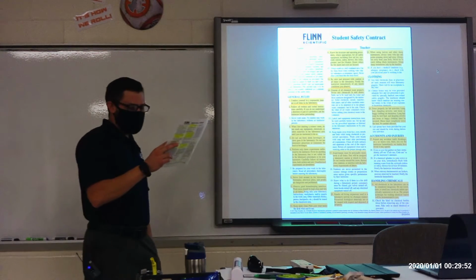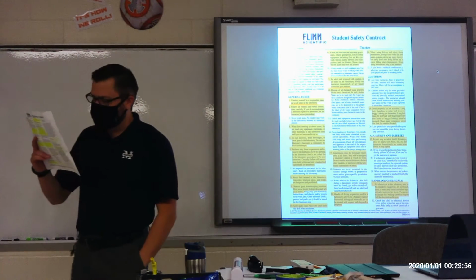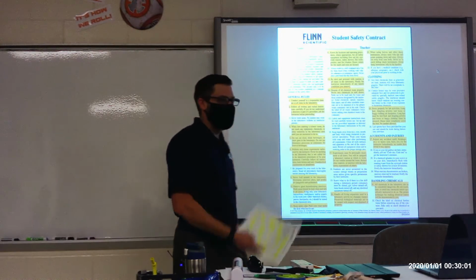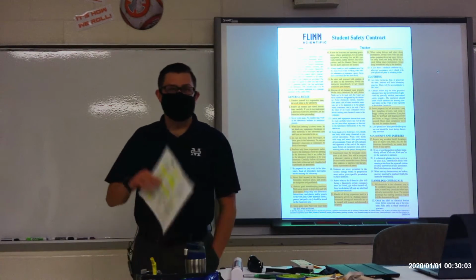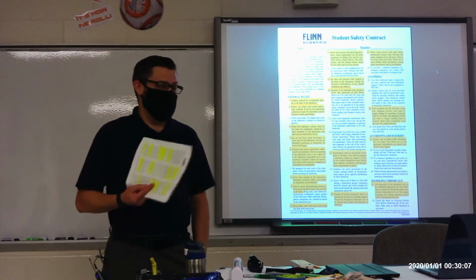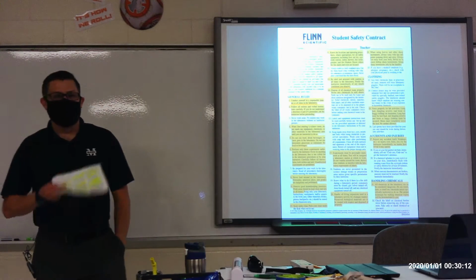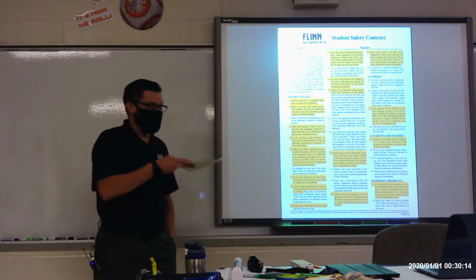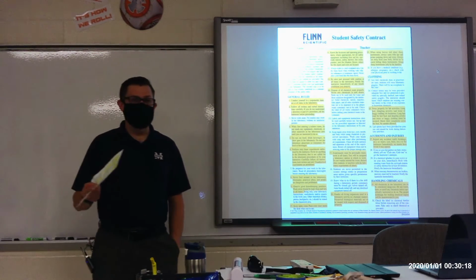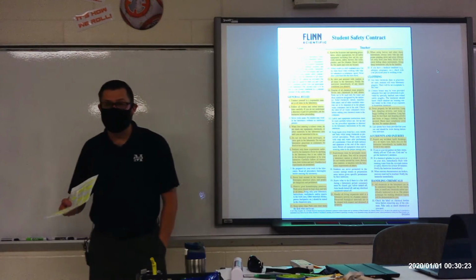All right, number 27. Report any accidents, spills, breaks, etc., or injuries, cuts, burns, etc., to the instructor immediately, no matter how trivial it may appear. If something happens, I want to know right away. And I get it that accidents happen, and when they do happen, we'll deal with them. But if something happens because someone was not doing what they're supposed to, then obviously there will be consequences that follow. But if somebody gets hurt or if something breaks, then I want to know about it right away.